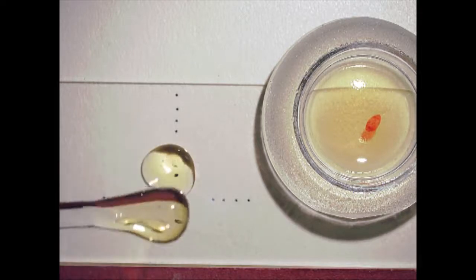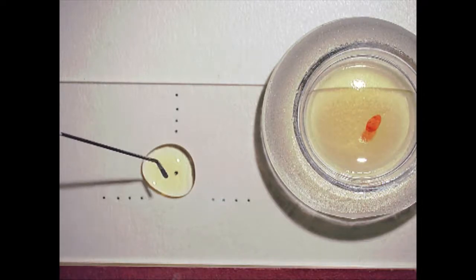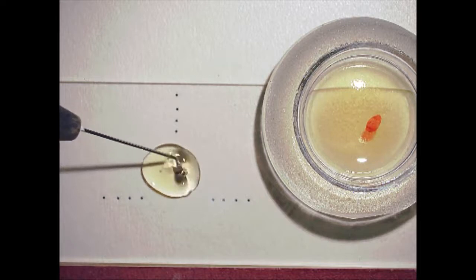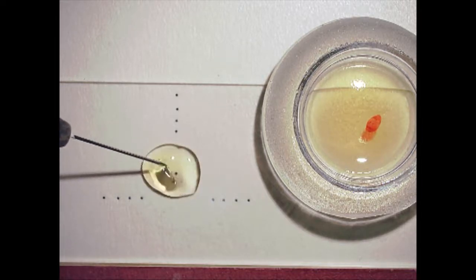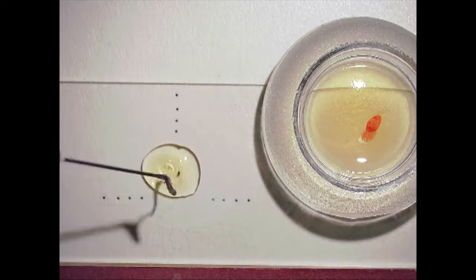I'm using a small dab of balsam in a bullseye, that center point there. And this is the microscope slide mounting stage. You can move that balsam around a little bit. I have kind of crosshairs that we've put on the slide mounting stage. It's underneath that microscope slide.